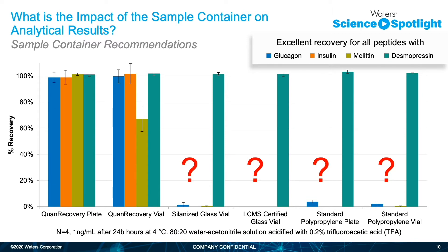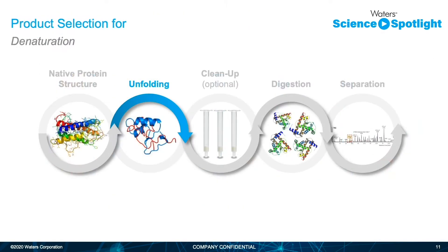We can see that every peptide will suffer from nonspecific binding loss at some point. Desmopressin is behaving very well across a variety of containers, with great recovery across all of them. That's not necessarily true for the other three peptides — we've got great recovery in the Quan Recovery containers, but we lose nearly all of the glucagon in the other containers and absolutely all of the insulin and melittin. Quan Recovery helps stabilize the samples over those long injection cycles, and can also aid in protecting samples during sample preparation.